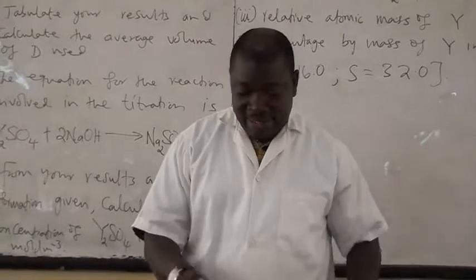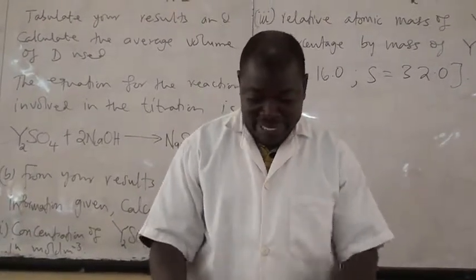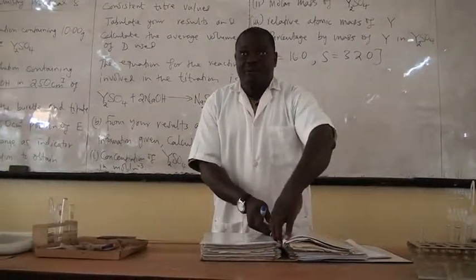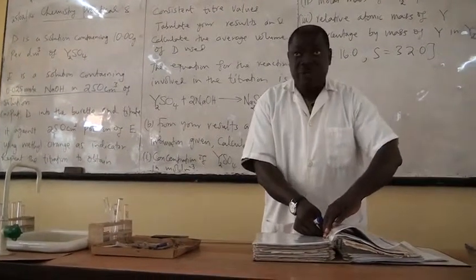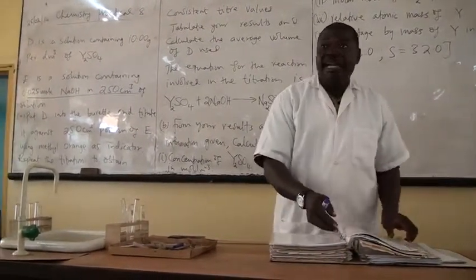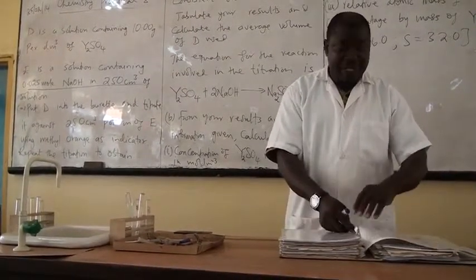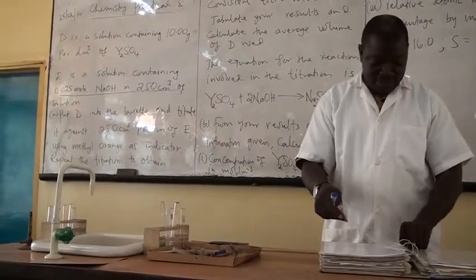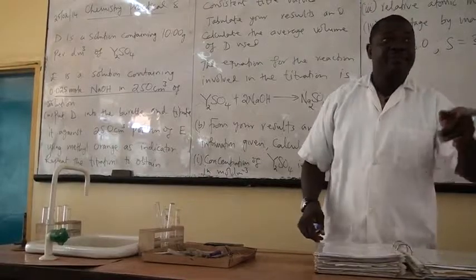As I said, what I just gave you was 2013 WASI Alternative B. What we did last week and discussed was WASI 2013 Alternative A. Next week when you can, we'll take Alternative C, and then afterwards we'll look at the qualitative analysis. Is that okay? Please, if you are ready, check your beakers.